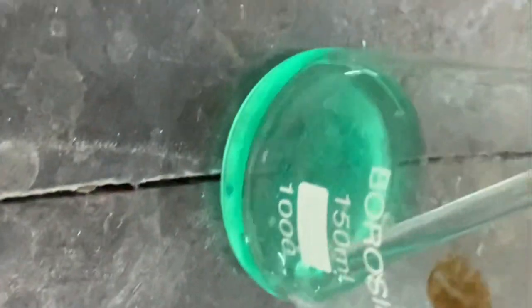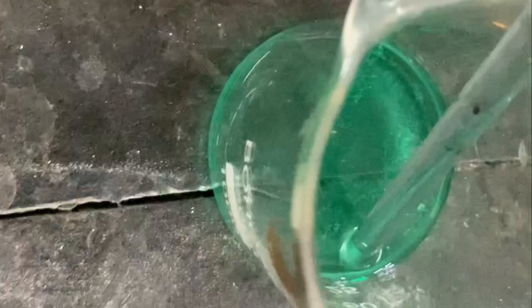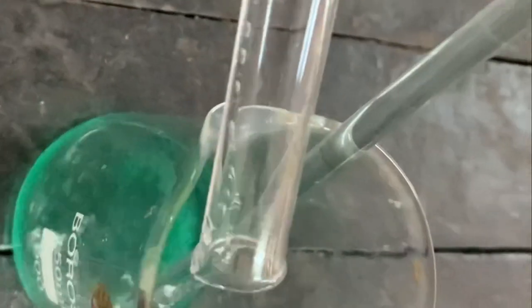Okay, so it is dissolved. Very few particles are left behind. You can see here. If it is not dissolving, we'll add 1 ml distilled water to it. Okay, so this is around 1 ml distilled water we have added to it.